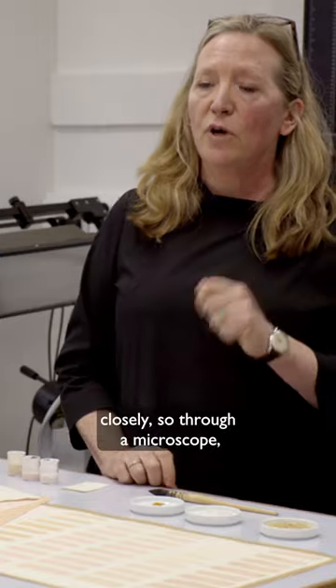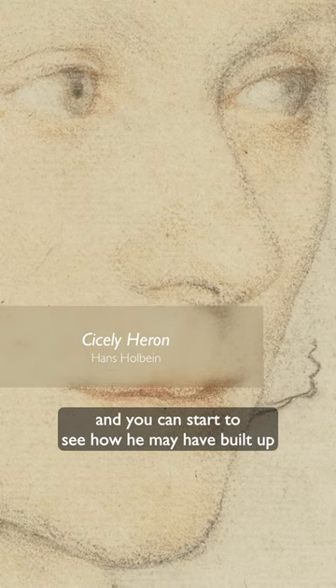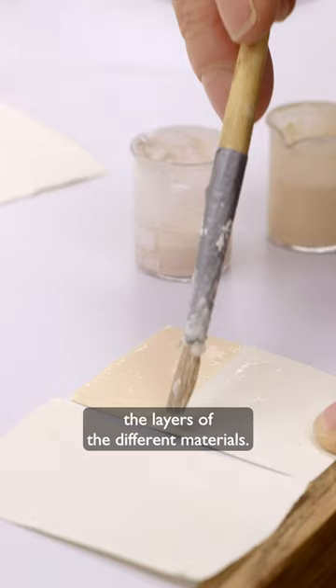We also examine more closely through a microscope, so you can really zoom in on the detail and you can start to see how he may have built up the layers of the different materials.